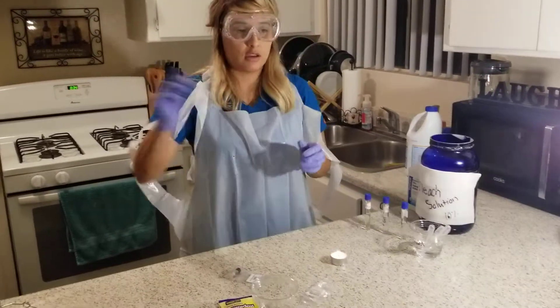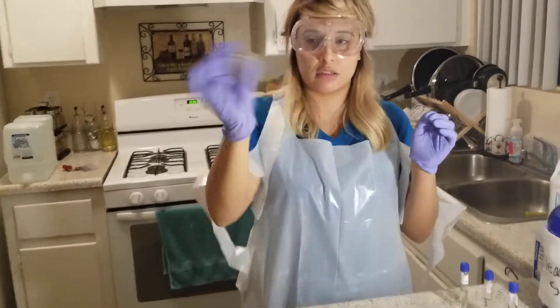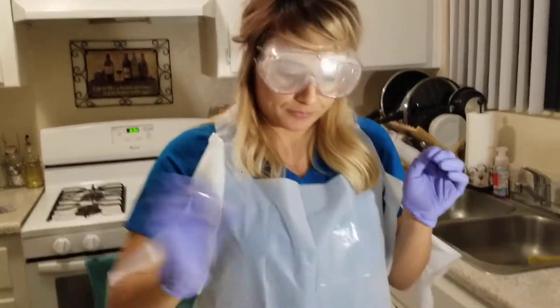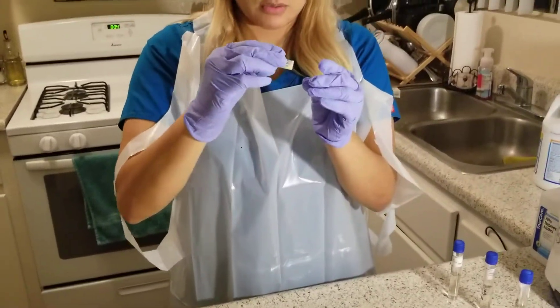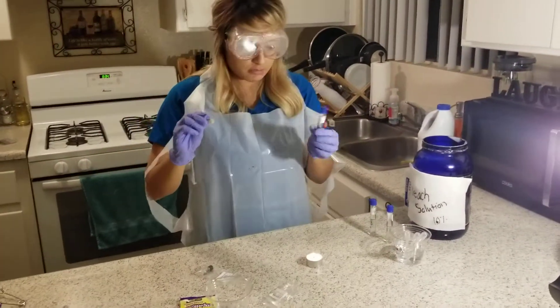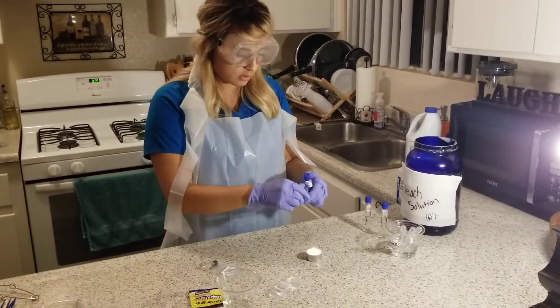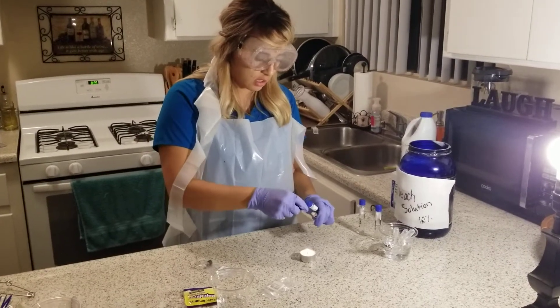I'm going to shake the tube until the tablet in there is dissolved. And then once it is all liquified, I will then grab the broth again and sterilize.